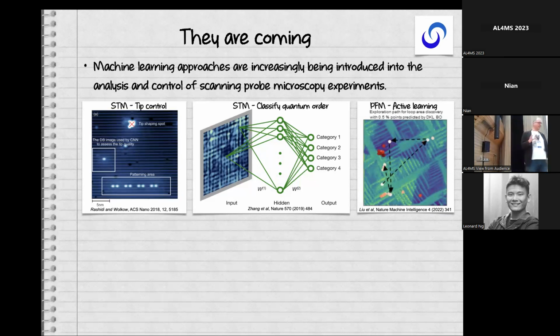We don't need to go into the details, but the idea is you do a large scale image, which shows you've trained the machine to recognize the characteristic features in that image, which are likely to be scientifically interesting. You then zoom into those points and do spectroscopy only at those points, maximizing the return on a given very difficult and time-consuming experiment. And this touches, I think, on some of the other talks we've seen in this meeting.